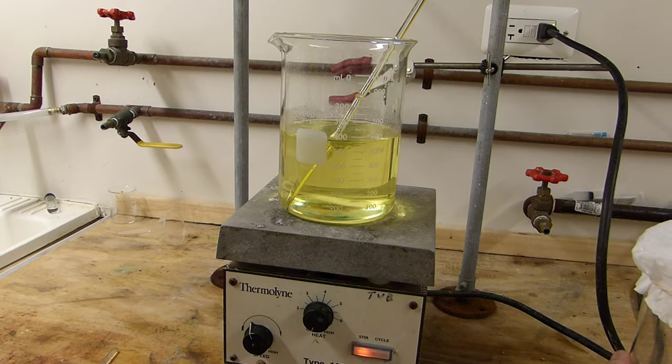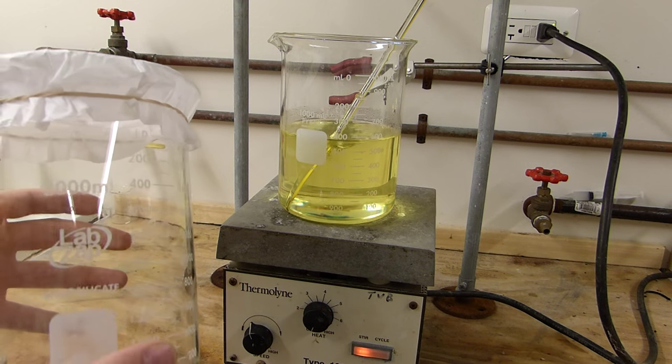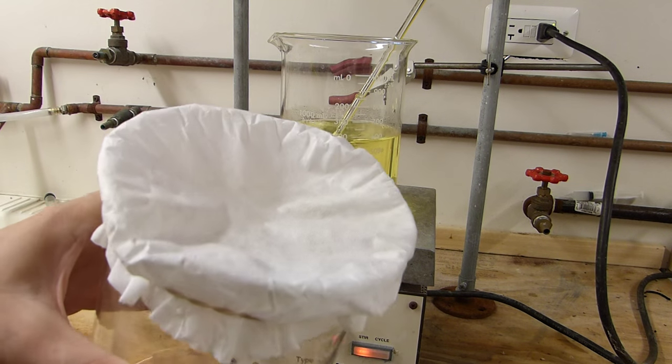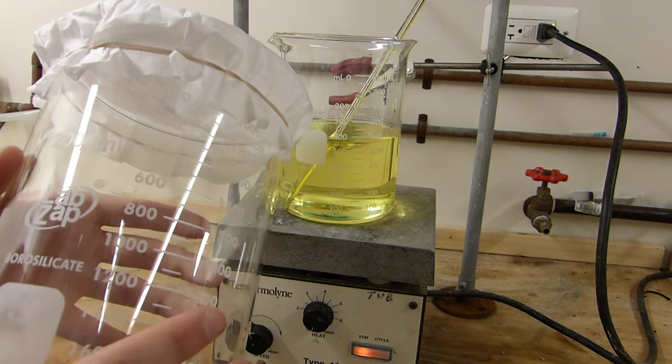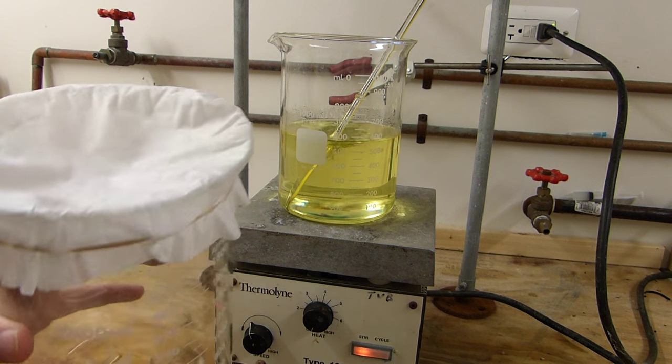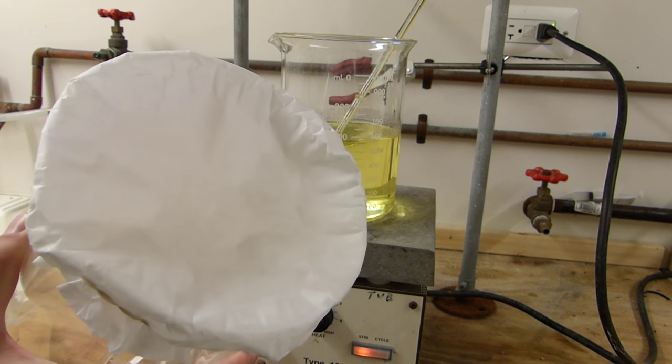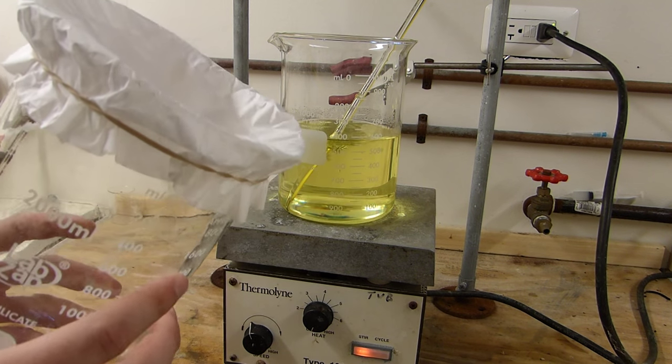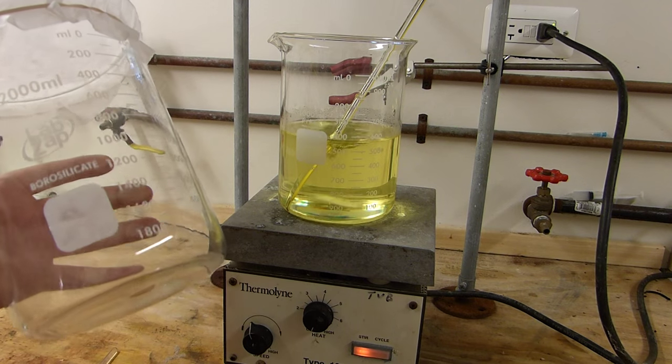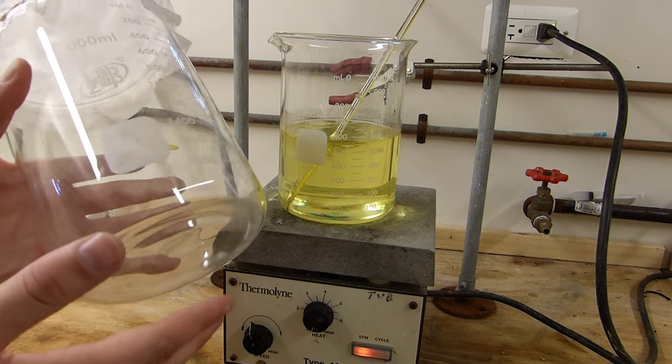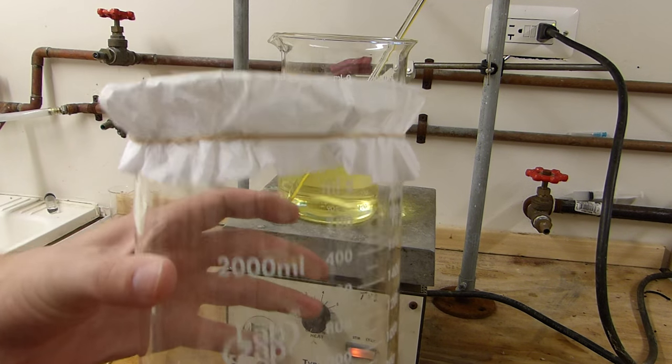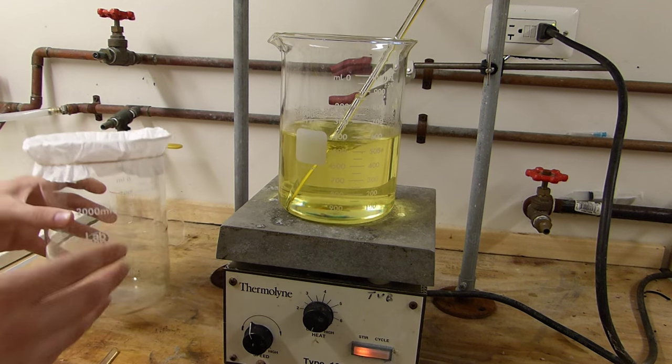But if you do need to filter it, I would suggest using a large beaker like this with a coffee filter over the top. Vacuum filtration is not needed because xylene has a very low viscosity and not a lot of surface tension, so it will go right through this filter without any problems at all. Pre-warm the beaker, of course, because you'll be dumping something that's almost 100°C into a cold beaker, and that's not good for the glass.